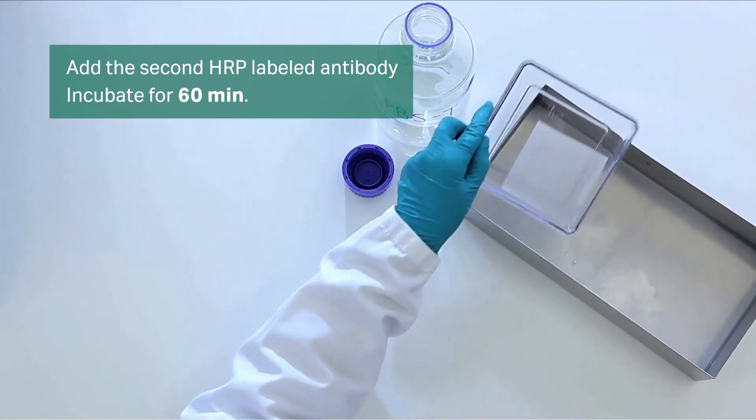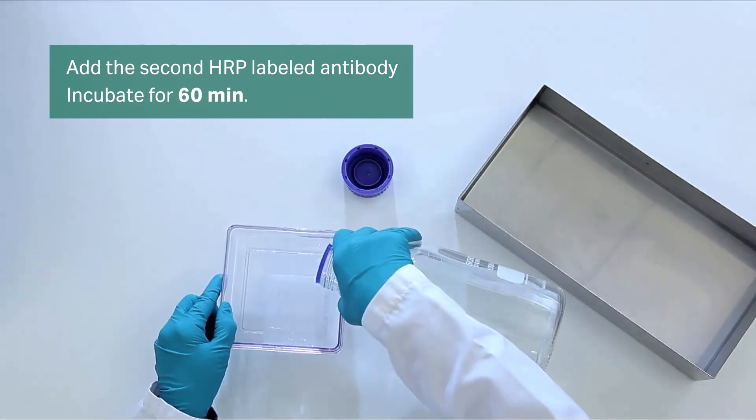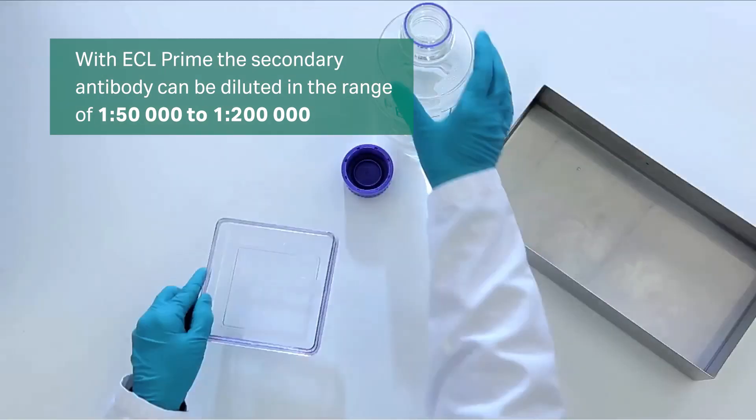Add the secondary HRP-labeled antibody to the membrane and incubate for 1 hour. When using ECL Prime, the secondary antibody can be diluted in the range of 1 to 50,000 to 1 to 200,000.